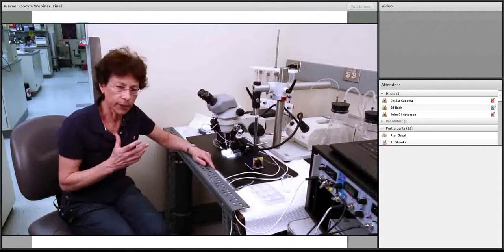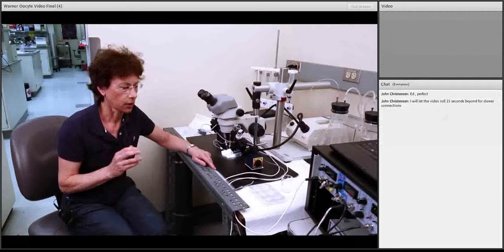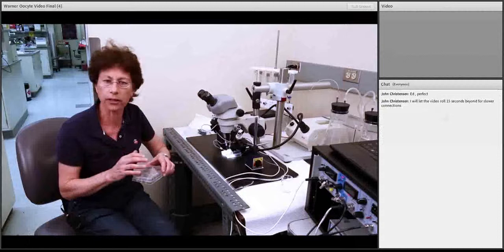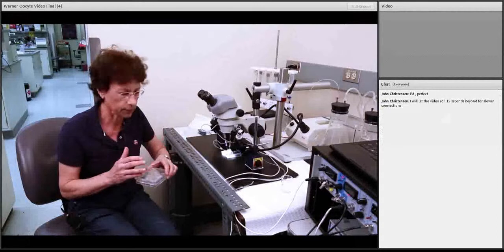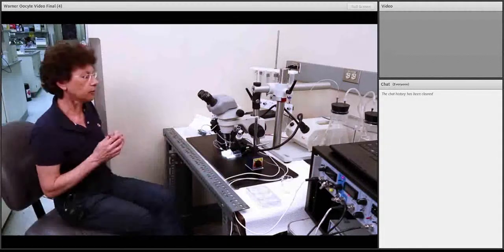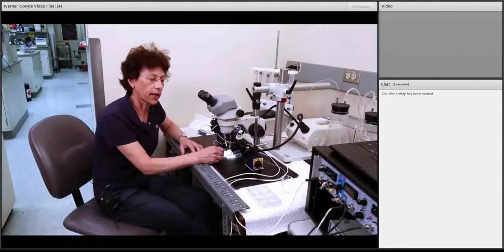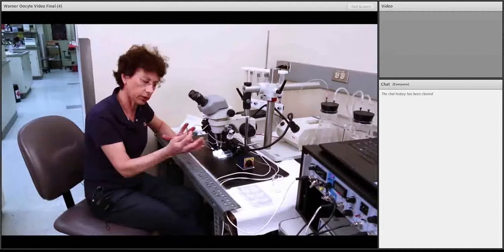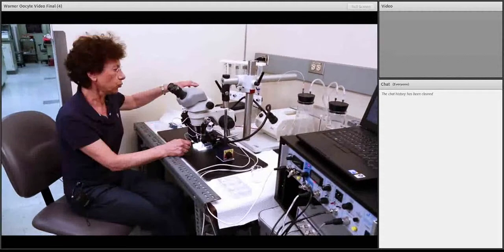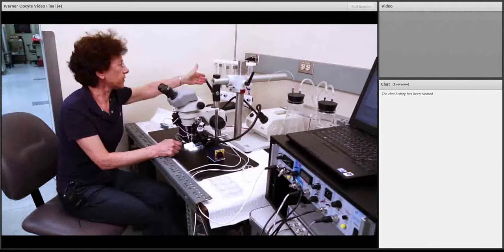The equipment is designed to be used with the oocyte expression system because the cells have the advantage of being very large. They can be micro-injected 1 or 2 days prior to the experiments. And then the technique is extremely easy to master. It basically consists of placing your cell that already expresses the channel of interest in this small chamber that is constantly perfused by the solution of your choice through this perfusion system.